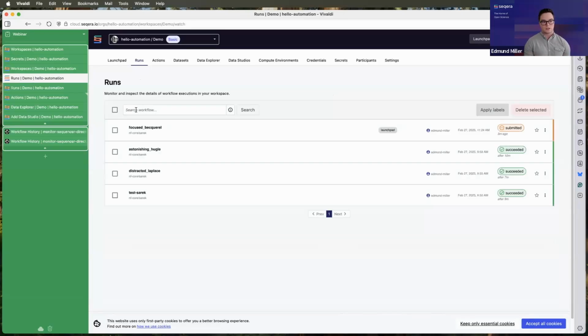We also talked a little bit about Seqera Kit on those. Now, let's talk a little bit about actually automating these. So the situation that I think a lot of people are familiar with is having a sequencer, and after the sequencer is done, it's run for 24 hours or so, and then it kicks off a job and it's finished, but you don't want to have to take those files and then manually launch a job from that. You want to automate that.